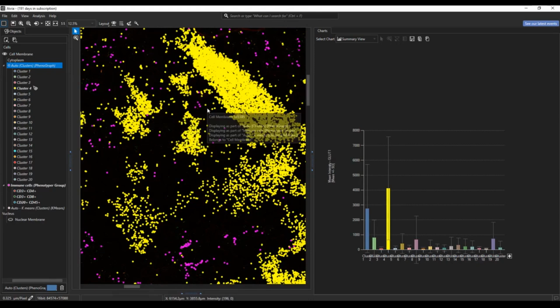I do have another hypothesis I wish to explore in this data set. Some of you may already be thinking about it too. The hypoxic area here represents a shift in the cell environment, and one that requires the cells to adapt in order to survive. We already see one of the ways the cell has adapted with the expression of GLUT1. So I'm curious to know if the cells within the hypoxic area have also perhaps begun to express or overexpress anti-apoptotic markers as another way to survive.